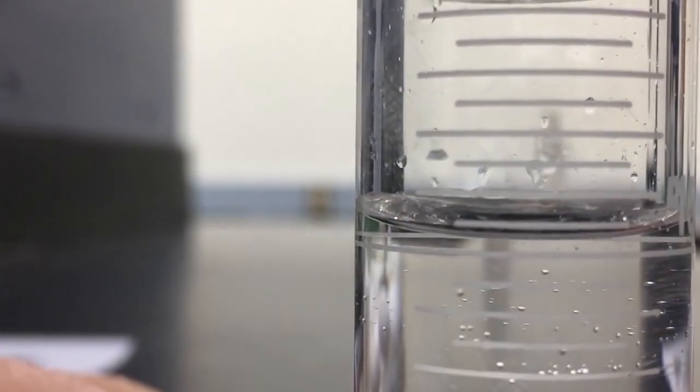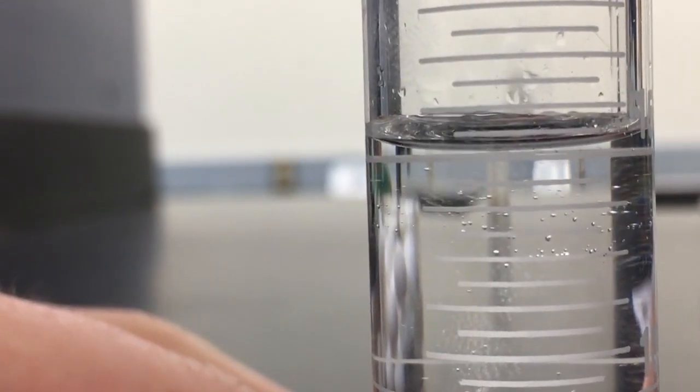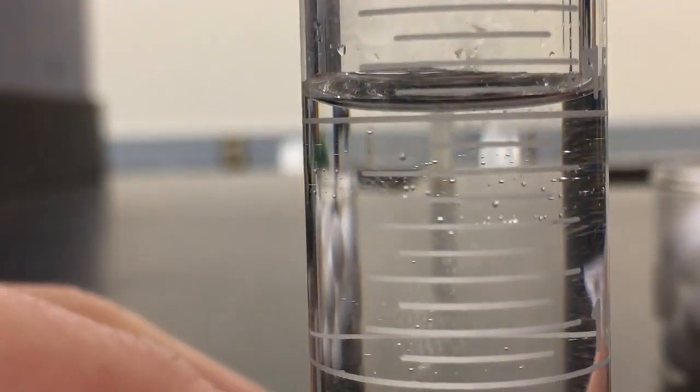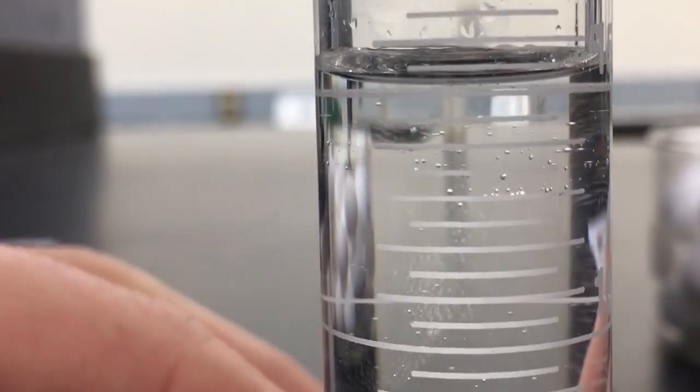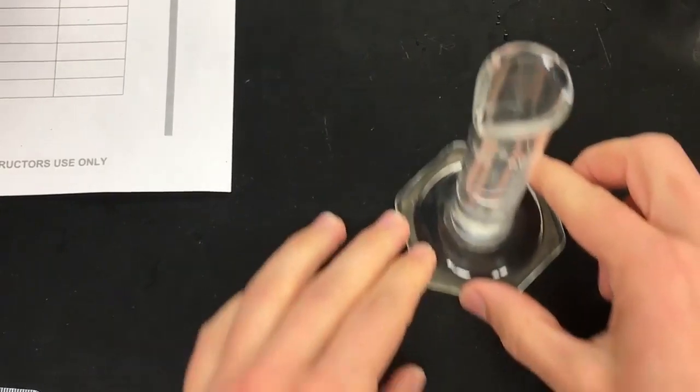So what I'm doing here, it's really hard to see. See how I'm kind of in between those two? And I'm right at eye level and I'm measuring, you can see the curve of the meniscus. I'm measuring the bottom of the curve. And to me it looked like it was 15.5 milliliters, right? So that's our initial volume. Put this back into the stand. All right, so we have some initial reading.